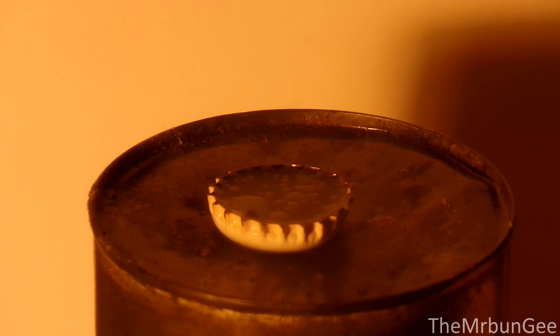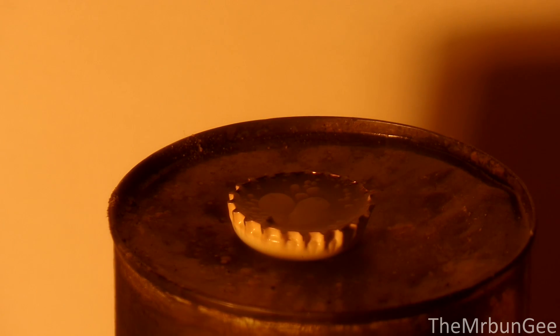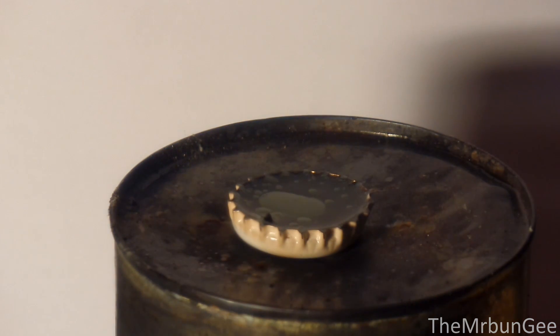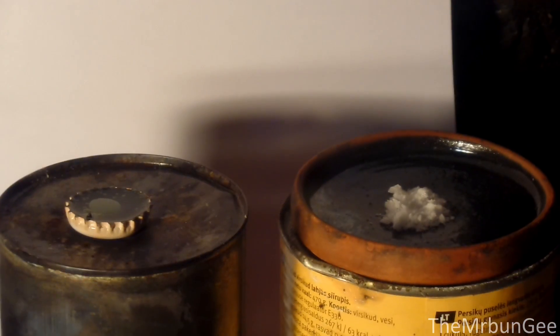Here comes the fun part. This time I made a small amount of manganese heptoxide in a bottle cap. You can see the blobs of heptoxide rising. And here is the hexamine powder.